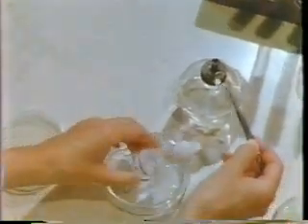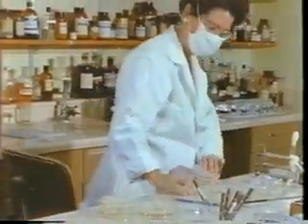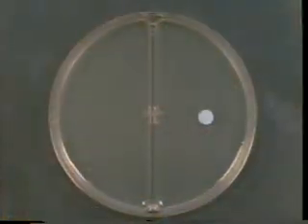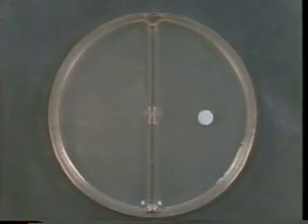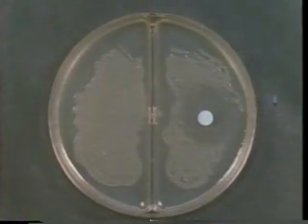A small piece of sterilized filter paper is wet with a sulfanilamide solution and placed on the bacteria in one compartment of the petri dish. The dish is placed in an incubator for 24 hours. During that period, seen here in time-lapse photography, the bacteria multiply and become visible as large colonies everywhere except in the area around the paper disc. The clear zone shows that bacterial growth has been stopped. This inhibition is due to the sulfanilamide from the disc.